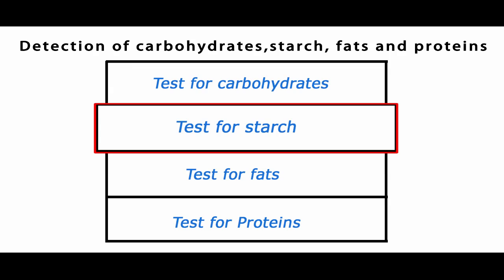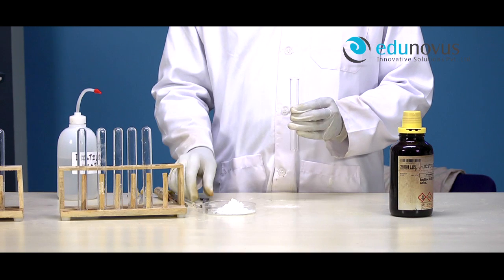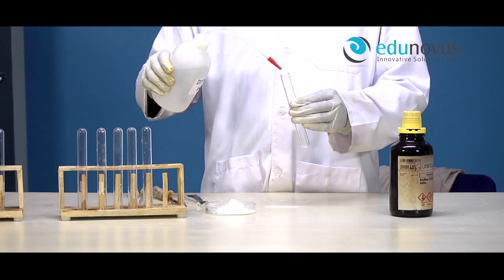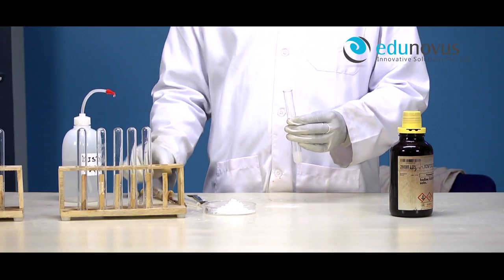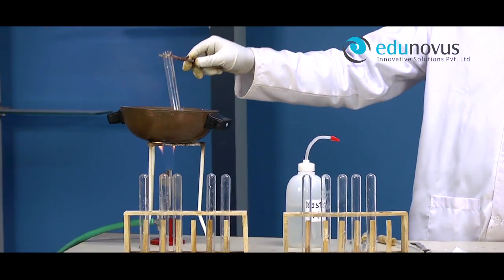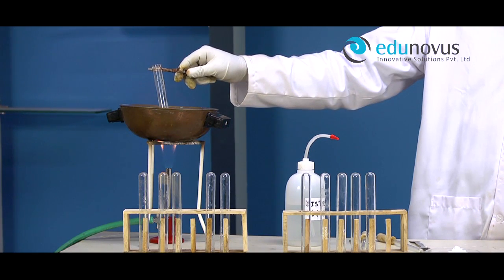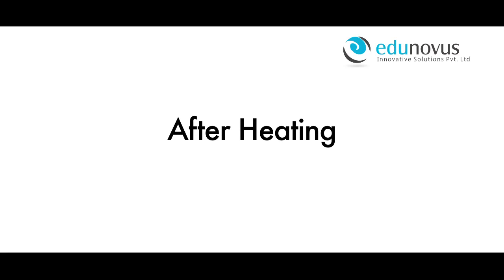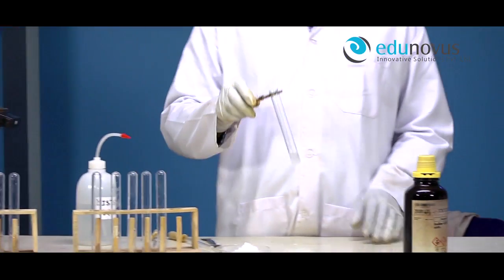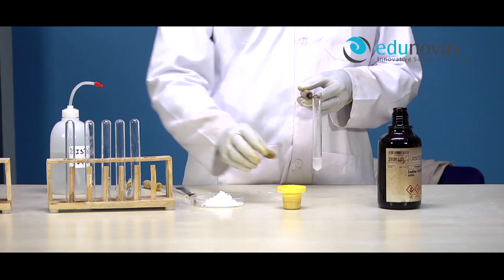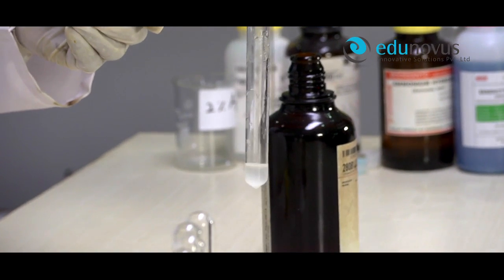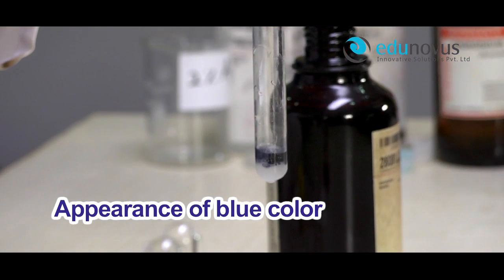Test for starch, also known as the iodine test. Take a small amount of the given food compound and add few drops of distilled water. Heat it on a water bath to get an aqueous solution of the food compound. Now add few drops of iodine. The appearance of blue colour indicates the presence of starch in the given food compound.